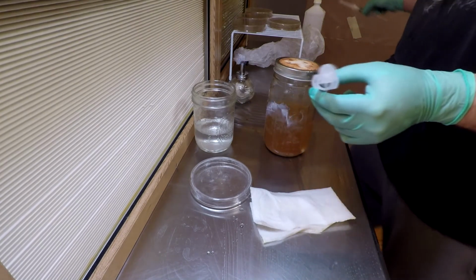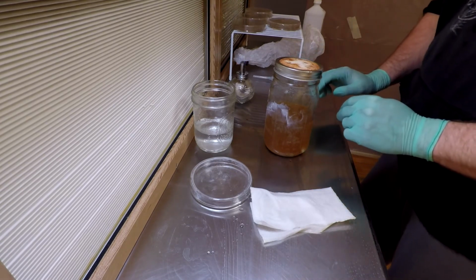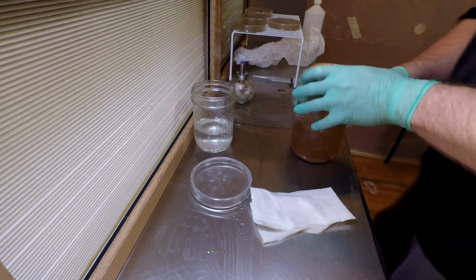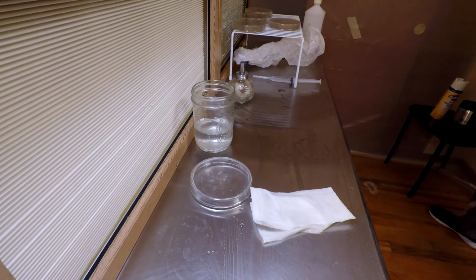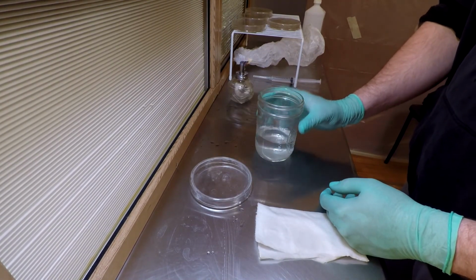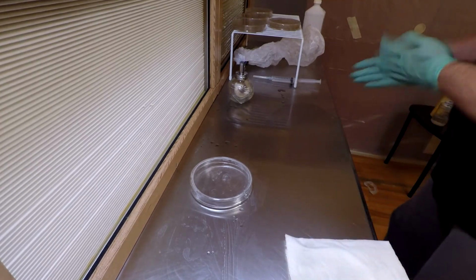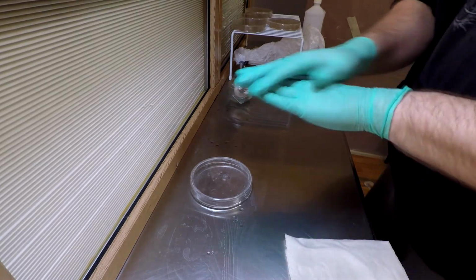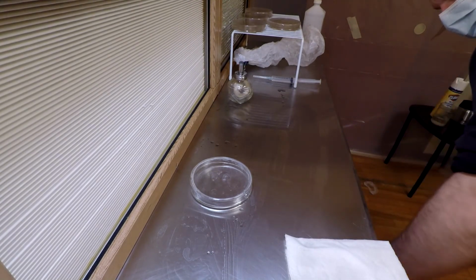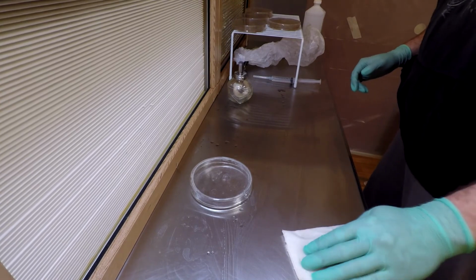Keep organized so I know what's what. I'll label this one to know that it's thinned out too. So seal that, get that out of the way. Now obviously I can make more syringes with this water, but I have plenty at the moment. My hands dry off again. I guess I have everything I need, actually.